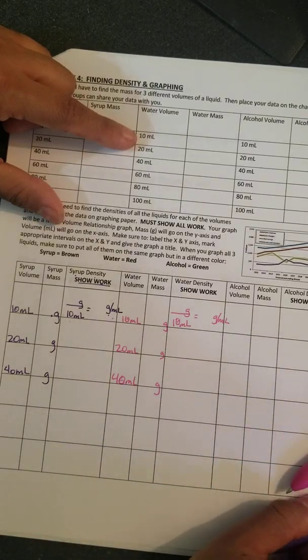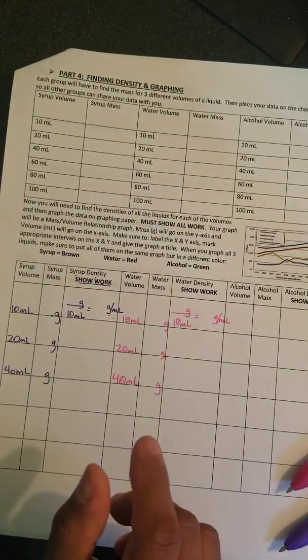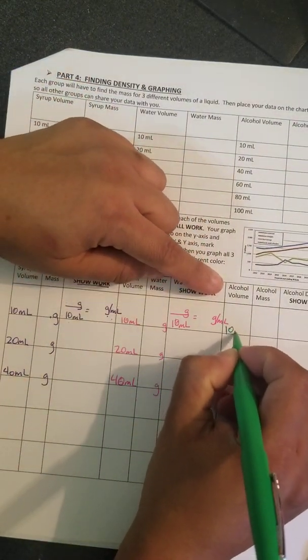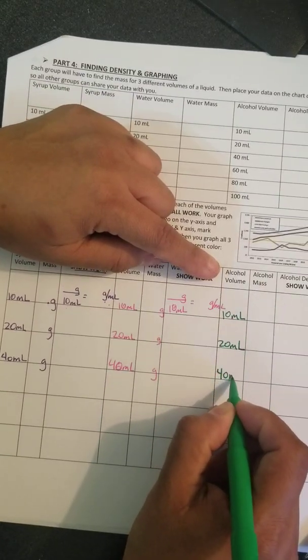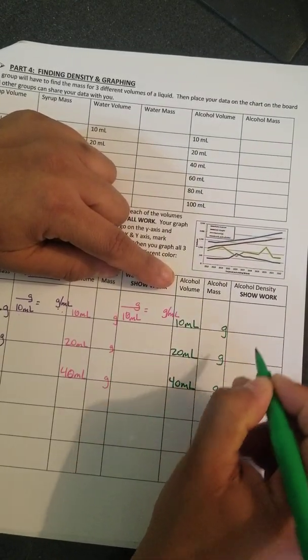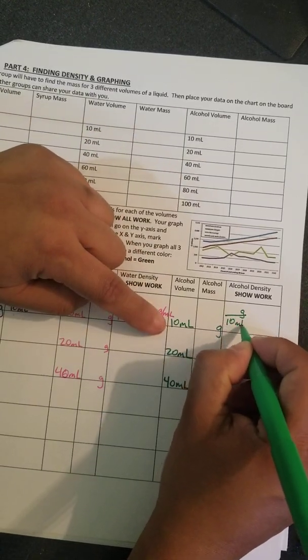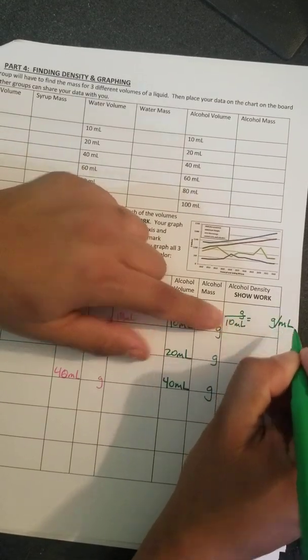Then you're going to come over here and you're going to get the rubbing alcohol. Again, it's going to be 10 mLs, 20 mLs, 40 mLs, and the mass we don't know yet. It's going to be in grams. You're going to show the density by doing the math, which is mass over volume equals, those units cannot cancel out, grams per milliliters.